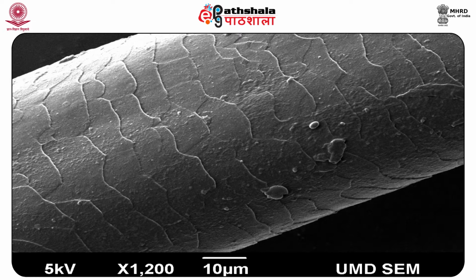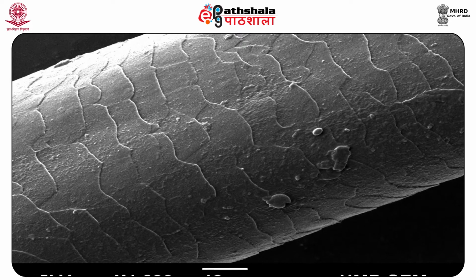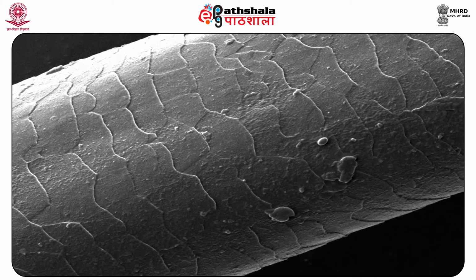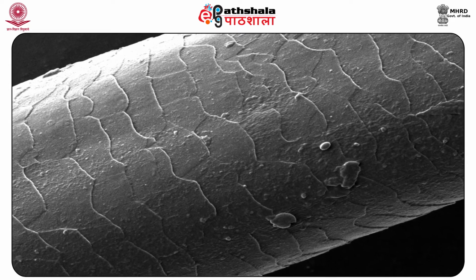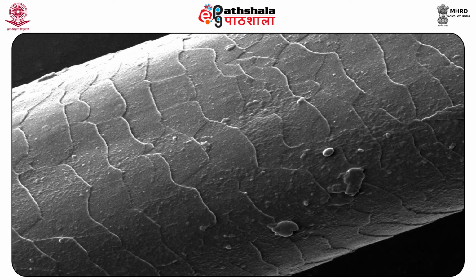Next comes the transmitted light microscope. For identification and examination of hair of high quality, the transmitted light microscope is required. The objectives and the eyepieces should permit observations in the range of approximately 40x to 400x. The examiner's ability to observe certain features is enhanced by using a polarized light microscope.